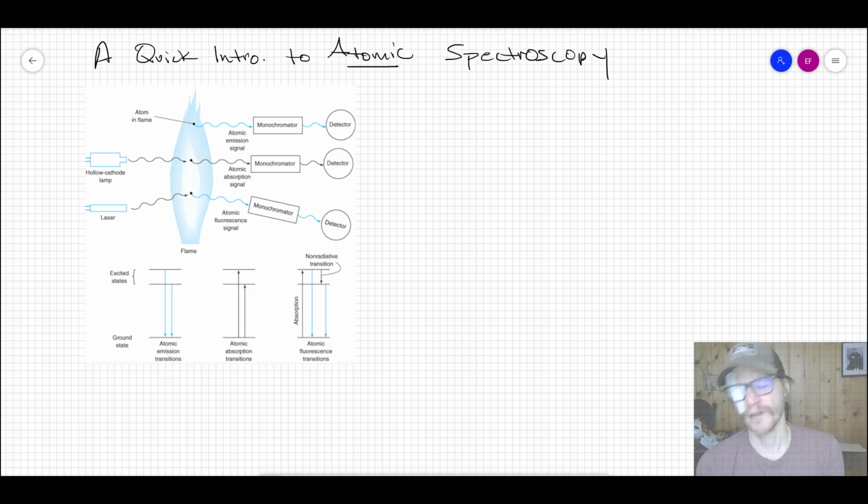We talked about fluorescence and how what's actually happening is both an electronic and a vibrational transition simultaneously, and then a sort of vibrational relaxation to a photon emission, and that happens at a longer wavelength.